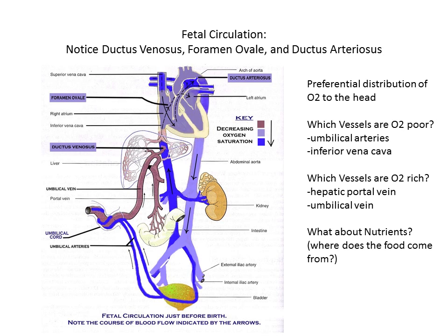So those three things are the ductus venosus, foramen ovale, and the ductus arteriosus. Their names are somewhat instructive. You'll find that anytime you have a hole in anatomy, it's called a foramen, such as the hole in your skull that your spinal cord will go through is a foramen. So foramen ovale, start there, is just a hole, and it is a hole between the left and the right atria. It's actually a hole in the heart.